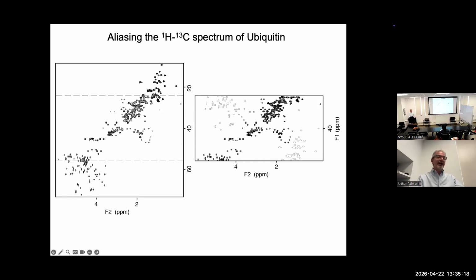Then these peaks should have gotten a phase greater than 90, but they're going to get a phase less than 90 because they're folded up here. And with exactly a half dwell, that makes them exactly upside down. They're exactly getting 180 degrees with the wrong phase. So again, whether that's good or bad depends on the particular experiment.